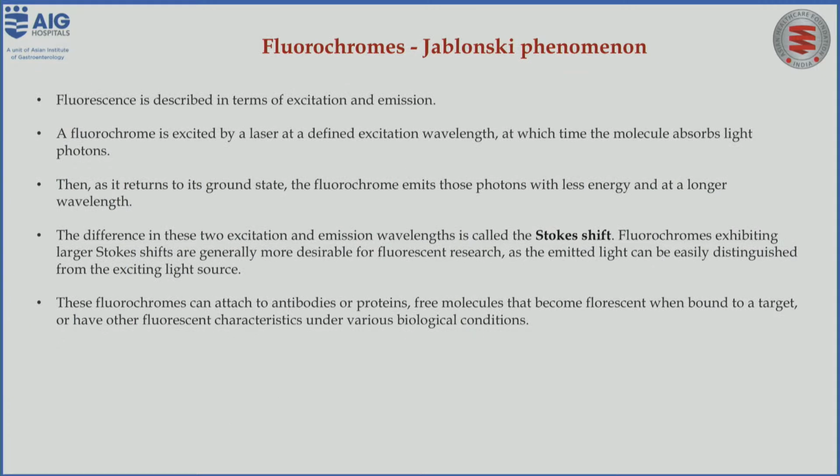Coming to fluorochromes, they are important in flow cytometry. When fluorescence is described, it is in terms of excitation and emission. A fluorochrome is excited by the laser at a defined excitation wavelength, at which time the molecule absorbs light and photons. Then it returns to the ground state, where the fluorochrome emits photons with less energy and a longer wavelength. The difference between the two excitation and emission wavelengths is called the Stokes shift.